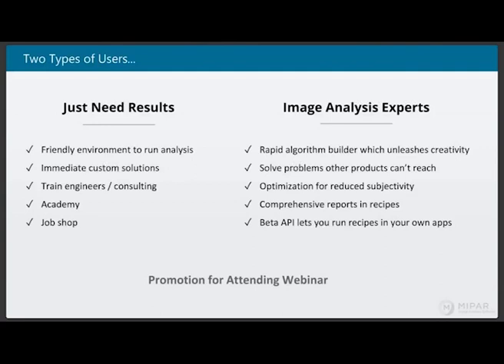Then on the image analysis expert side, there are folks that have been hardcore ImageJ, Python, OpenCV users who have fallen in love with MIPAR's environment. It really is a creativity enhancer, where the sky is the limit with the algorithms that you can put together. You don't have to worry about debugging your code or managing your code or managing window names.